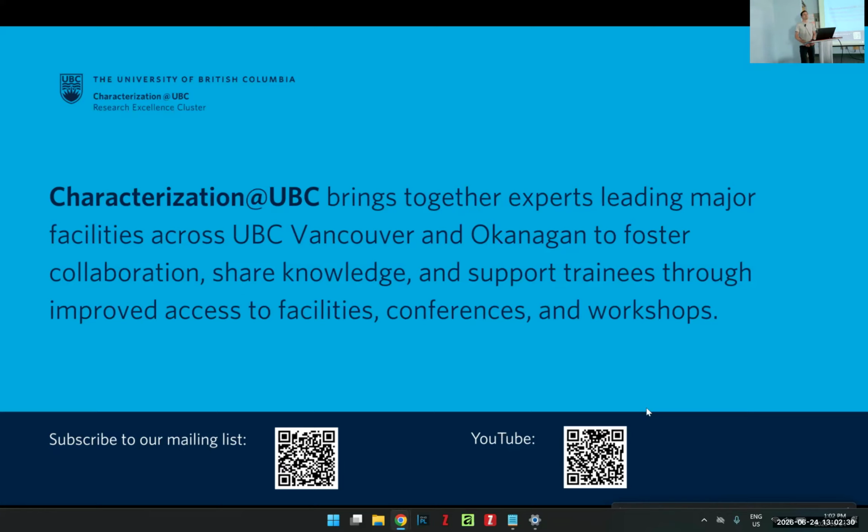They are based in Marpole, not too far from here in Vancouver, and were founded in the late 1990s, I think, by a group of individuals interested in bringing together automation and controls, and this overlaps with characterization, as Mike will talk us through, with effectively a new way of thinking of optical microscopy in those technologies.